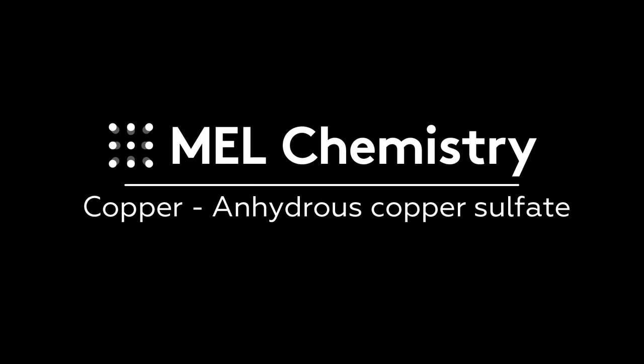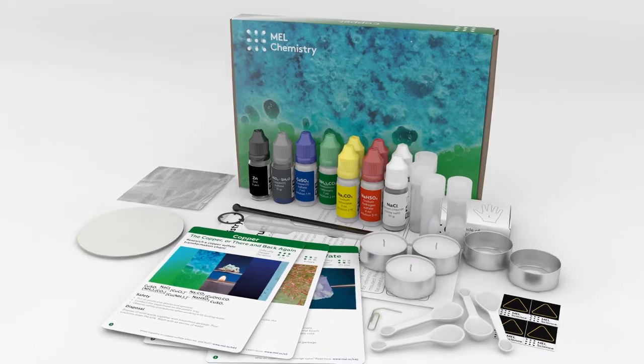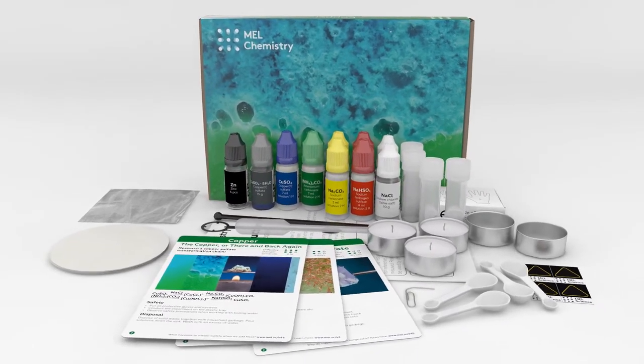Welcome to the wonderful world of chemistry. Today, with the copper experiment set from Mel Chemistry, we will learn how to dehydrate copper sulfate.